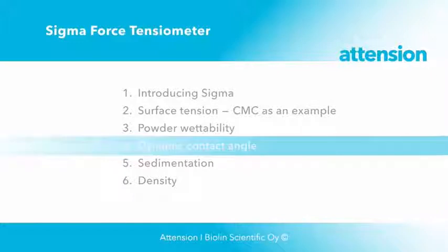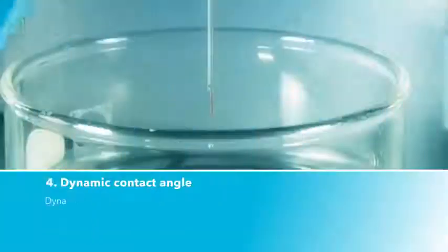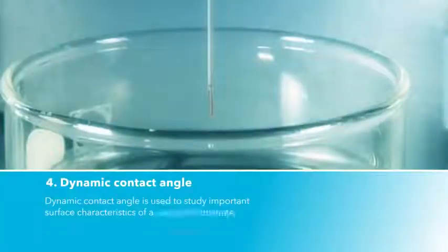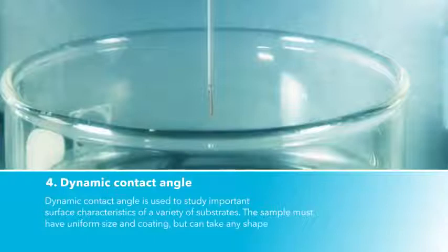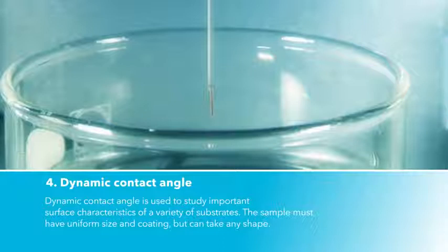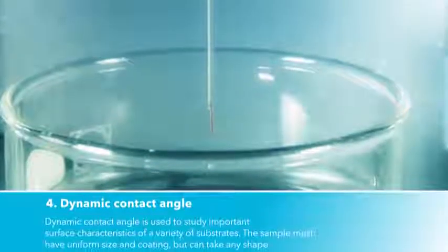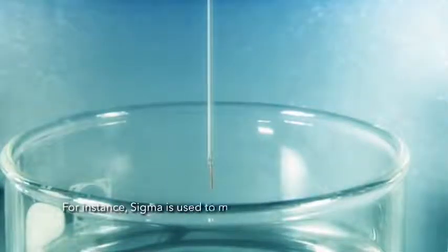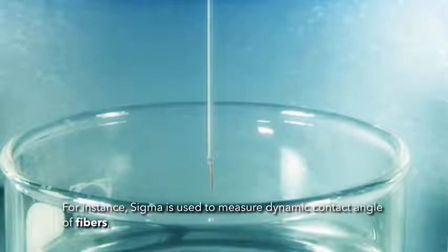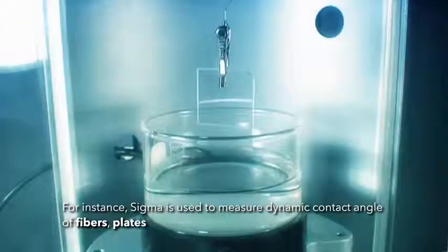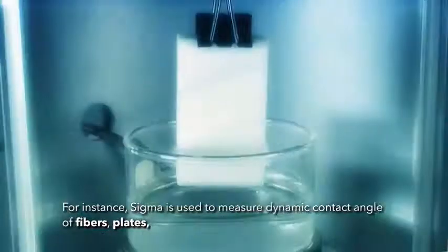Next, we will measure a dynamic contact angle. Dynamic contact angle is used to study important surface characteristics of a variety of substrates. The sample must have uniform size and surface properties, but can take any shape. For instance, sigma is used to measure dynamic contact angle of fibers, plates, polymer blocks, and so on.